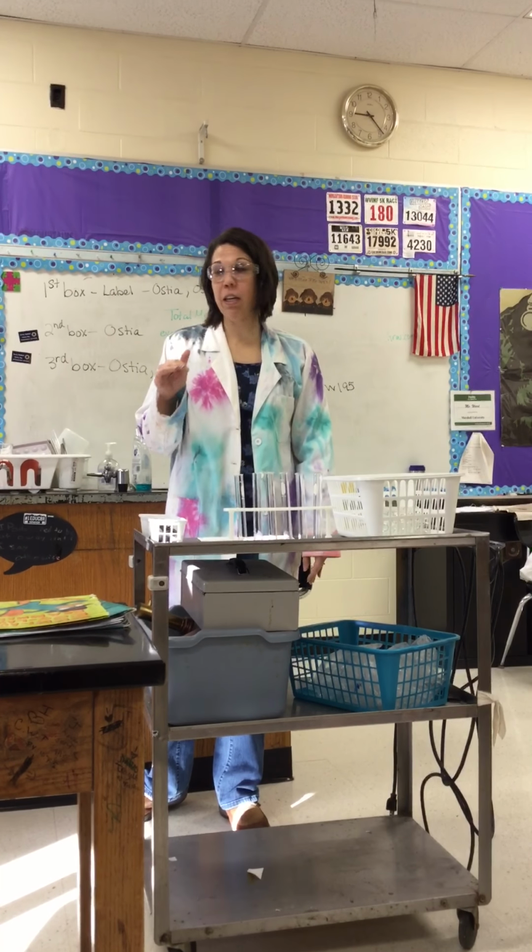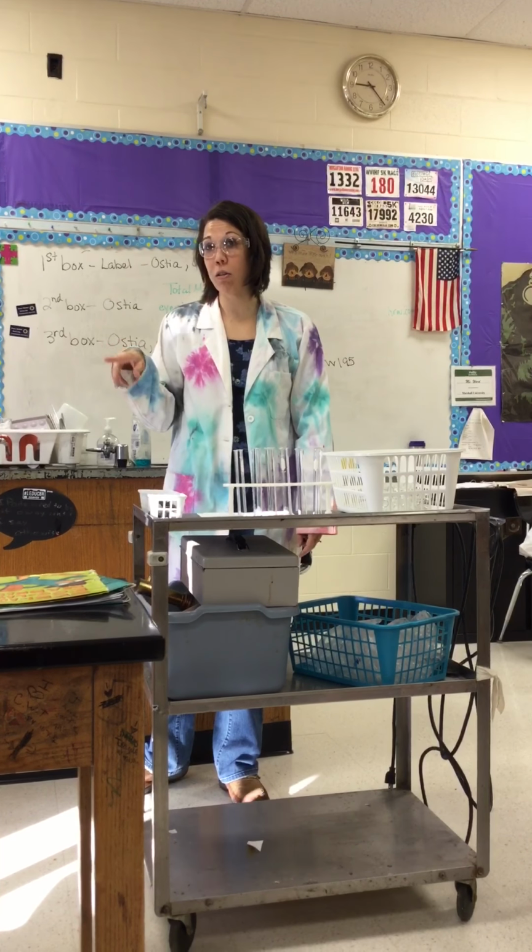All right, so the first thing we're going to do for testing for fats is solubility.